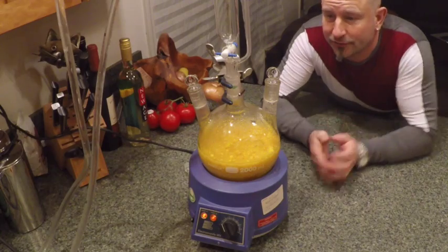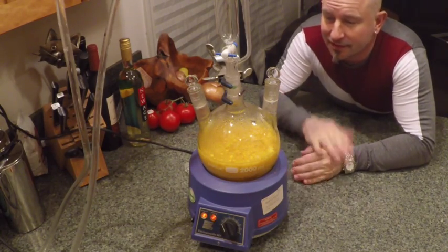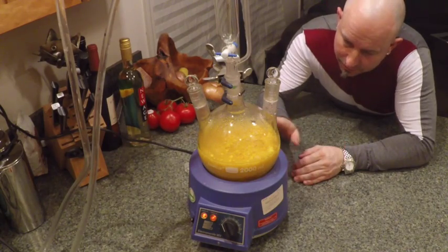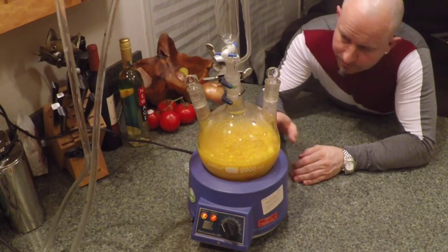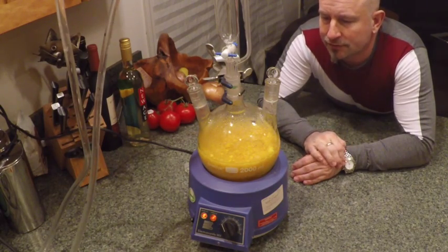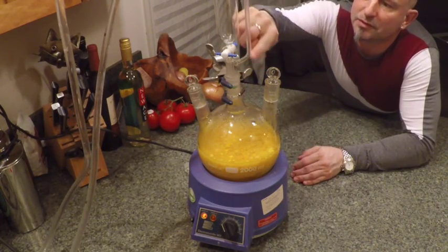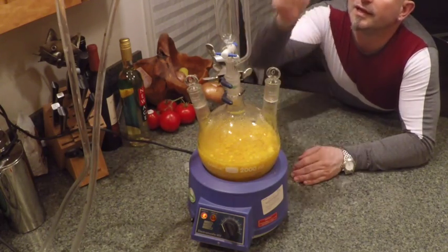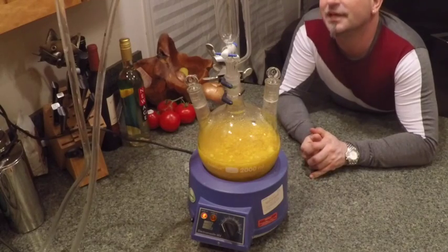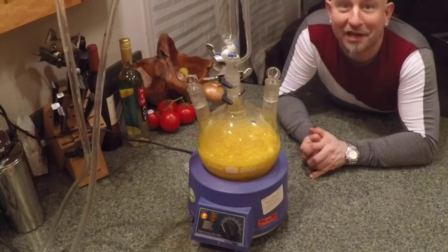Orange oil is fairly temperature sensitive and it's fairly easy to taint if you overheat it. So I'm using a low heat, which is taking a while, but it's just now starting to get close to boiling point. We can already see a bit of vapour in here — we'll just let that go for a little while longer and see how much oil we collect.